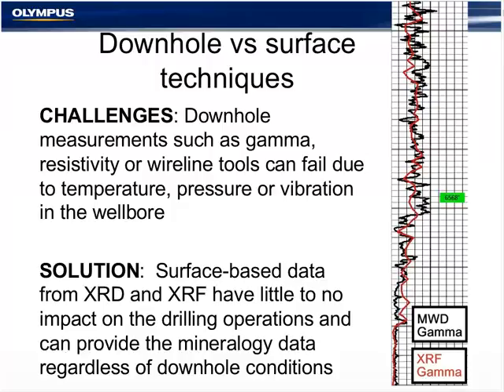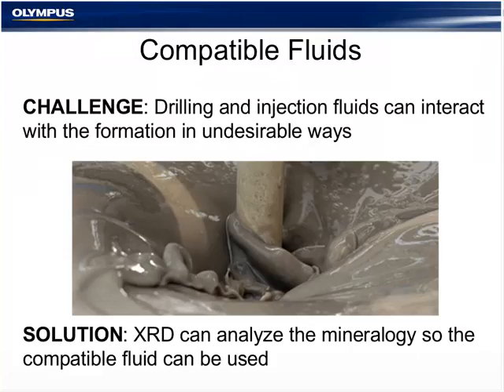X-ray diffraction provides easy identification of corrosion and scaling products with on-site corrective actions. That's a great use to have this right on site. Certain clays and smectites will swell up in the presence of water. When they swell, they can trap the drill pipe and block up the well hole. Often in this case, you may want to switch to an oil-based drilling mud.